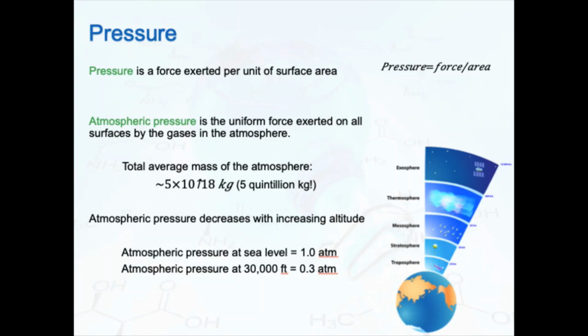One thing to note as well is when you're doing your calculation for this lab, you don't want to use 1 atmosphere because it's not the true barometric pressure or atmospheric pressure of the room.